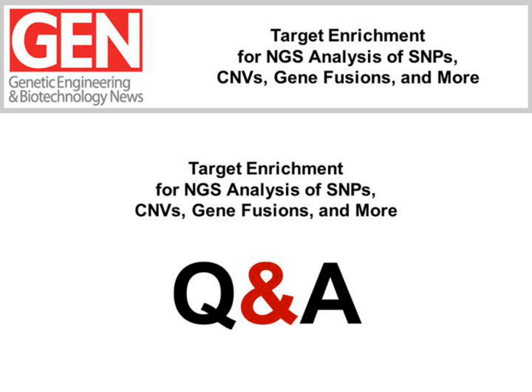All right, and how many sequencing reads do you recommend for the 500 gene fusion panel? So for that panel, we would recommend about 8 to 10 million reads. That will get quite a comprehensive view of what's happening inside your samples. And which human brain reference did you use? So the human brain reference was an Ambion product, which is a mixture of 23 different brain samples. It's something you can just purchase directly from them.